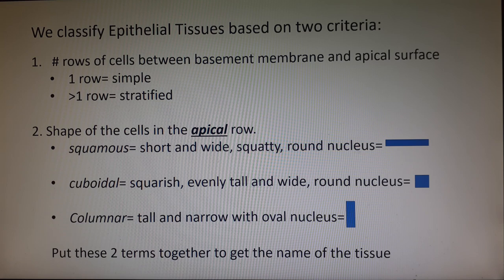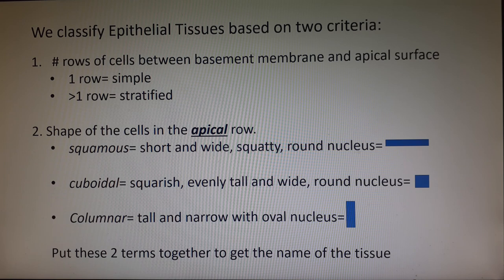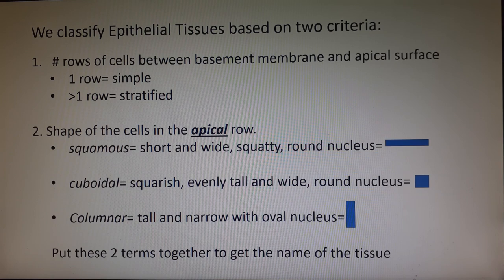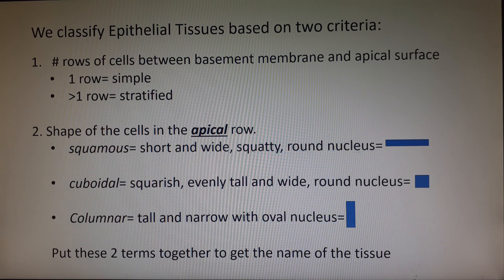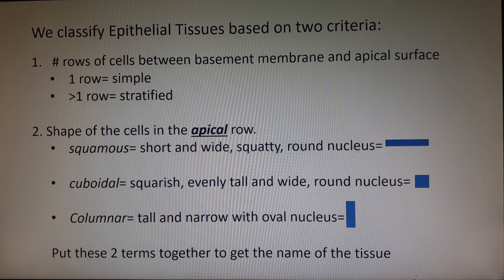There are different kinds of epithelial tissues, and we classify each tissue type based on two criteria. The first thing you look at is how many rows of cells exist between the basement membrane and the apical surface, and you only have two choices. If there's one row of cells on the basement membrane and that same row is also the apical layer, we give that tissue the first term: simple. If there's more than one row — all the way up to infinity — we call that tissue stratified. Strata means layers, so you need at least two.